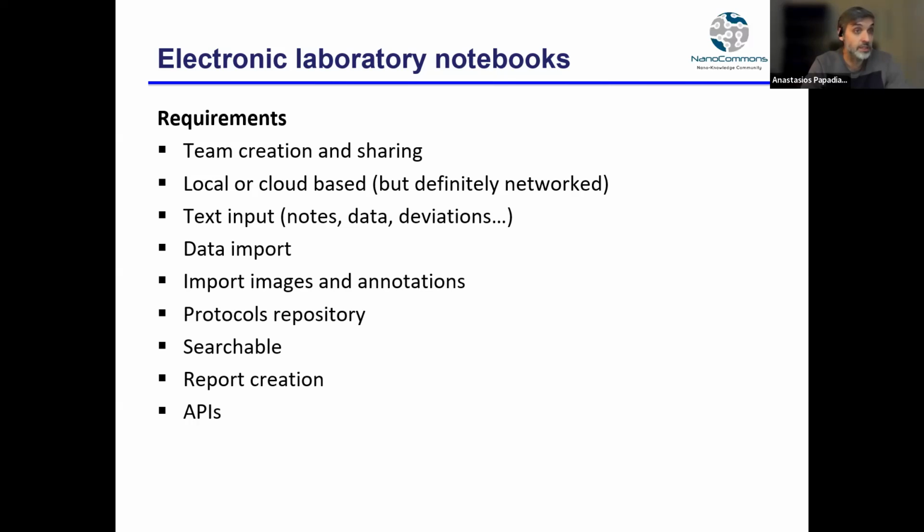But you have everything gathered in one place, organized and structured, so you can use a simple search function like you do in every website or in Google or a search engine, etc., to find something that you want. Also, such software provides a good starting point for report creation or publication creation, because they can more or less be used to create reports, etc.